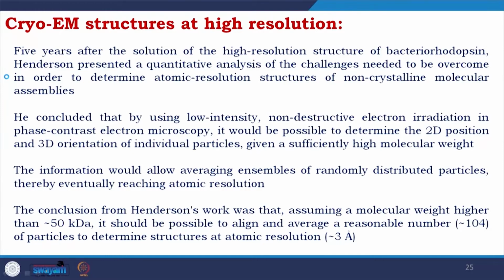The conclusion from Henderson's work was that, assuming a molecular weight higher than 50 kilodalton, it should be possible to align and average a reasonable number, 10^4, of particles to determine the structure at 3 angstrom. So, 50 kilodalton, 10^4 particles, 3 angstrom resolution.